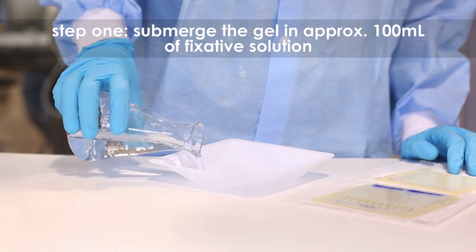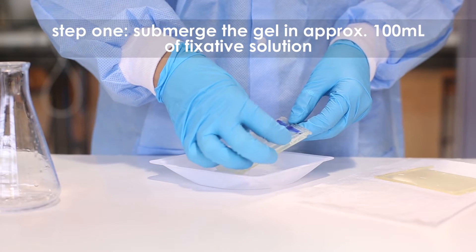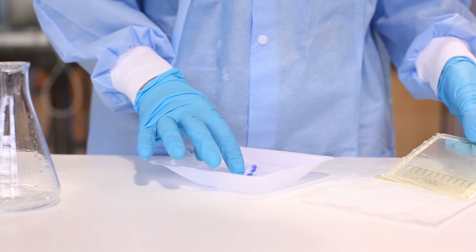Step 1. After the gel cassette has been disassembled, carefully slide the gel off the plastic back plate into a small tray containing approximately 100 ml of fixative solution. The gel should be completely submerged.